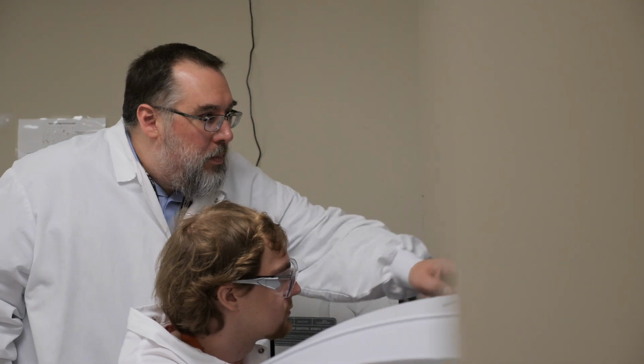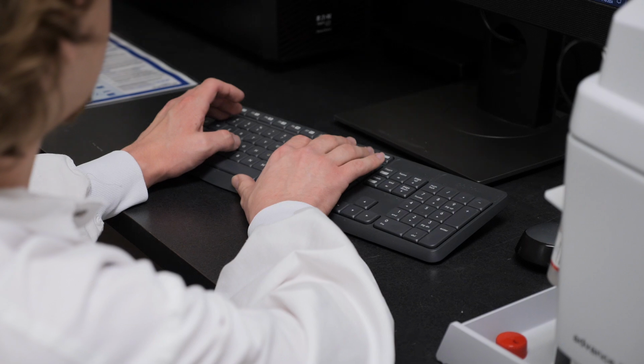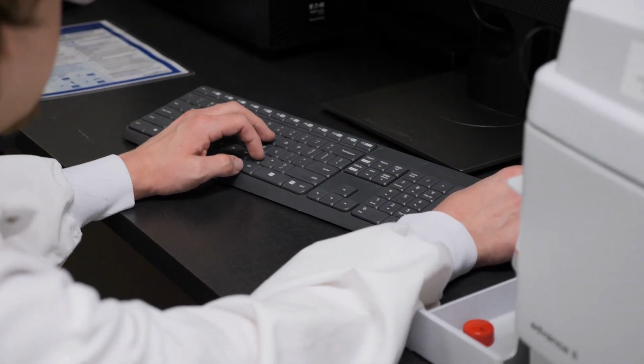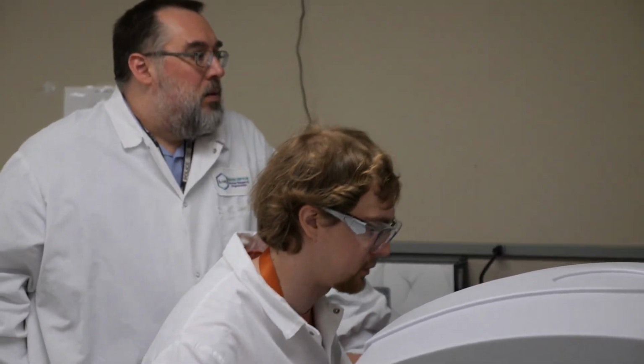There are certain organisms that are expected to be tested in one of these studies: Aspergillus brasiliensis, Candida albicans, Staph aureus, Pseudomonas aeruginosa, and E. coli. However, you are also expected to develop certain environmental isolates that you have monitored in your facility to test against these disinfectants. So the process is to make sure that you provide different pieces or coupons of your facility that are representative of the different surfaces that you clean in a particular area.